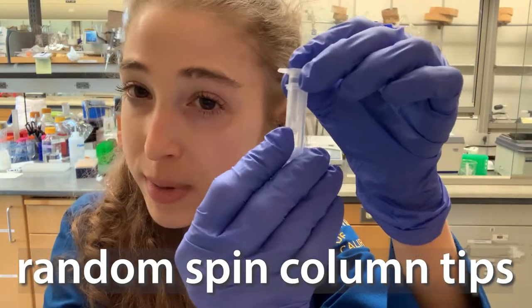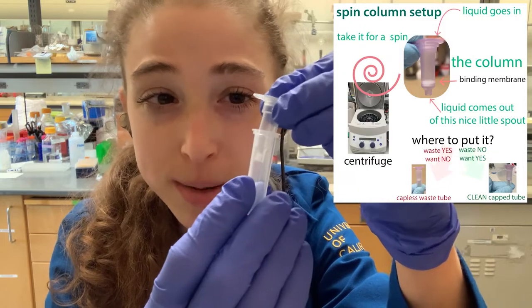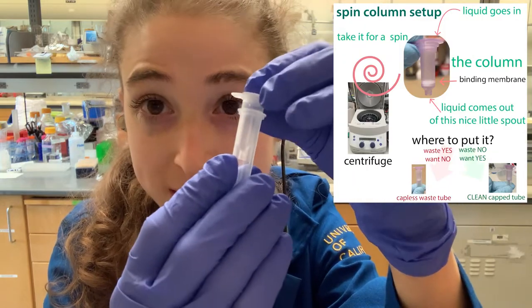Quick lab tip: when you're using spin columns such as these for a mini prep or PCR purification, it's really important that you are careful when you take the tube in and out.